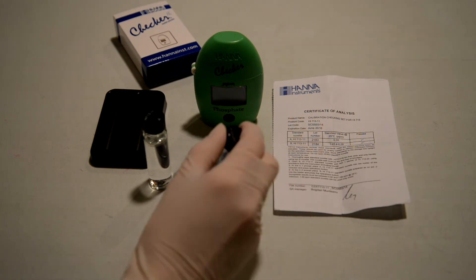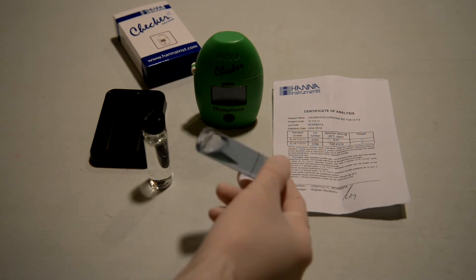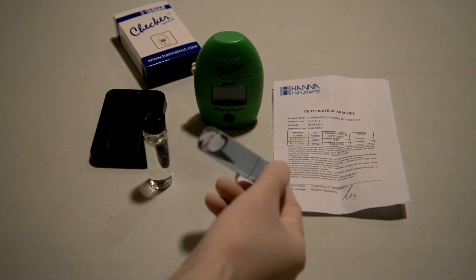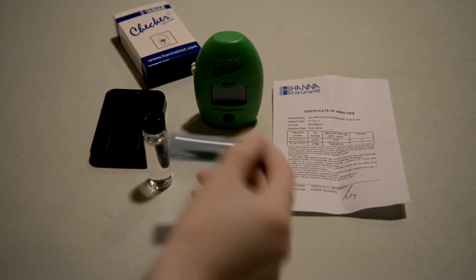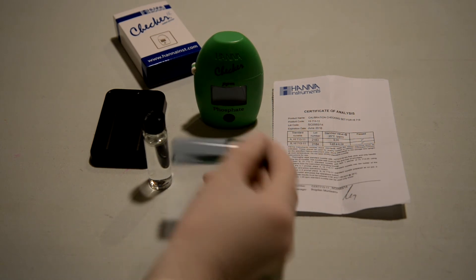Every time you want to test your phosphate checker, you'd have to buy a new calibration kit. But other than that, we still recommend doing this — at least once. If you've gone through the effort of buying a checker, you might as well buy the calibration kit for it to make sure it's actually accurate.